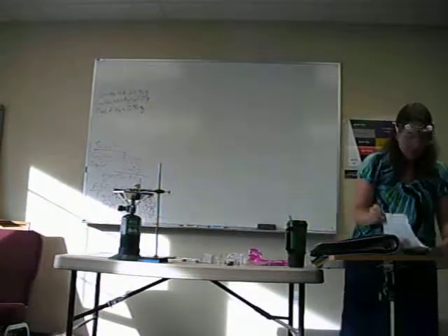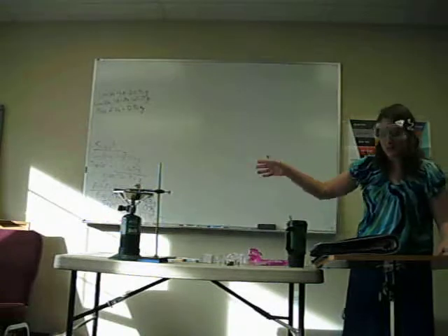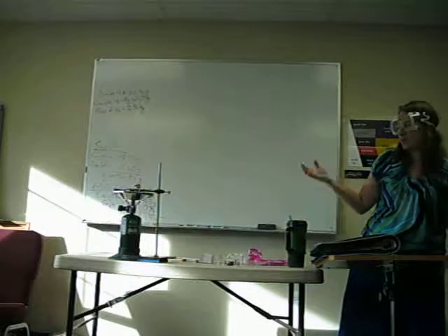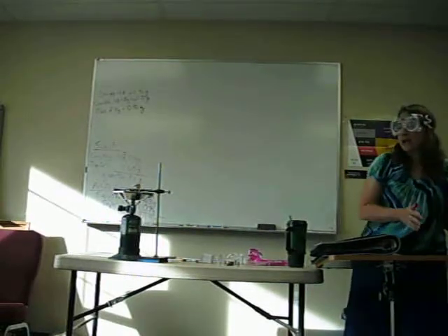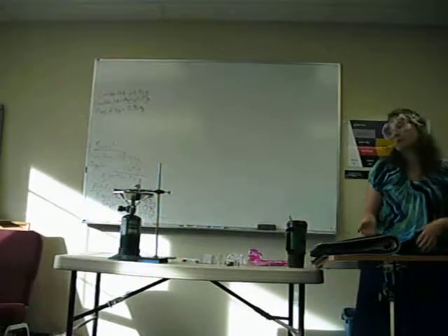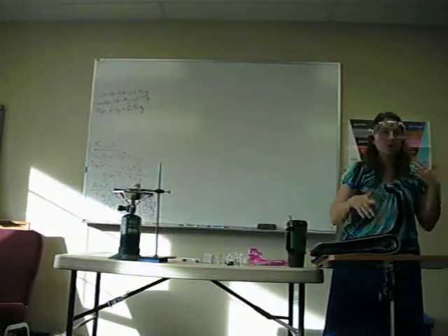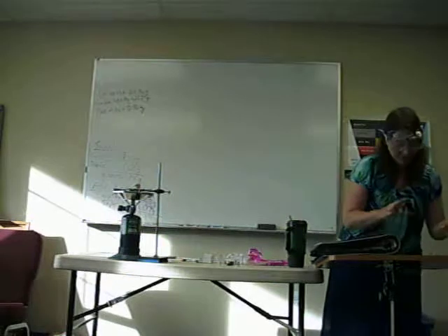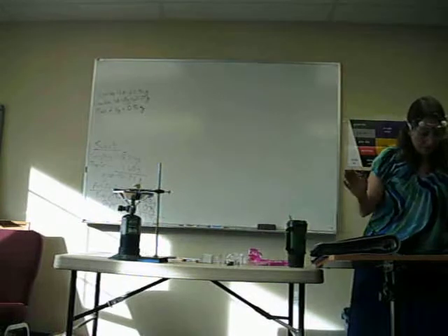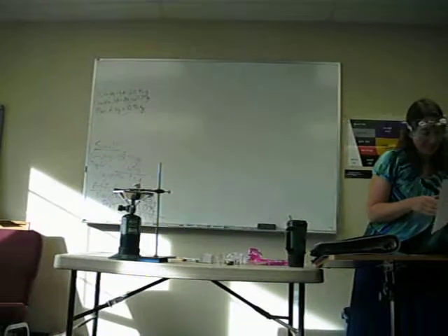Alright, so we can do some math while we're chewing our gum, and then we'll weigh the gum, and this can keep on heating. When you do this in college, you actually will do it very systematically, where you heat it up, weigh it, heat it up, weigh it, heat it up, weigh it, and it takes forever because you have to let it cool and weigh it. But you have to stop when it has stopped actually gaining weight, because then you know the reaction is complete. It takes forever, so we don't have time to do that. We're just going to do it for a really long time and hope the reaction is complete at the end. And we can compare to the predicted value and see how well we did. It works out well for most years.